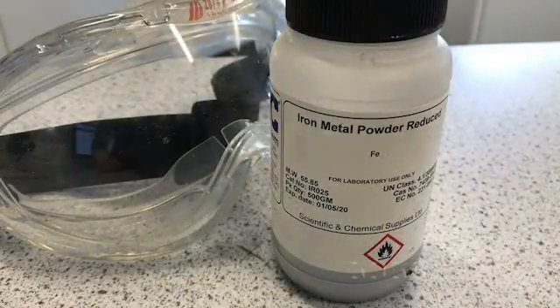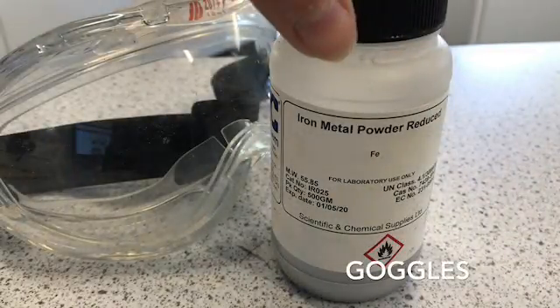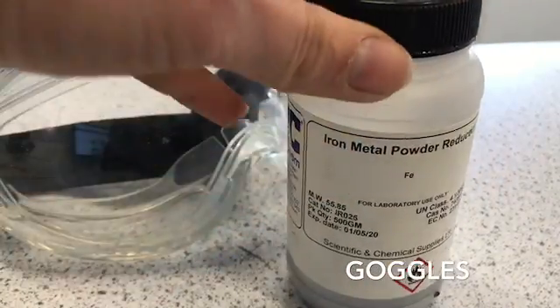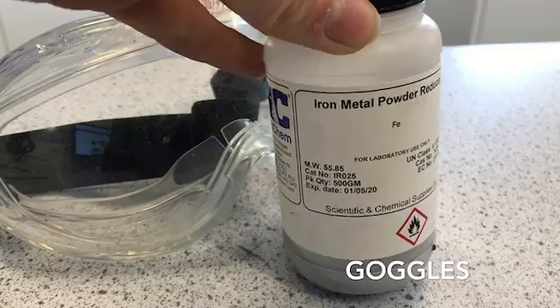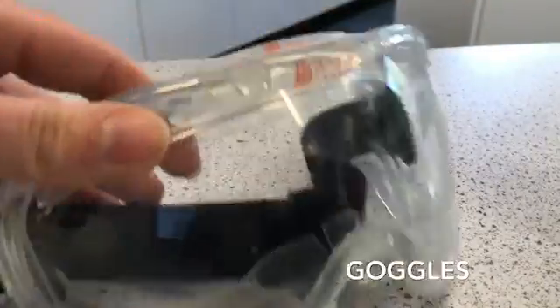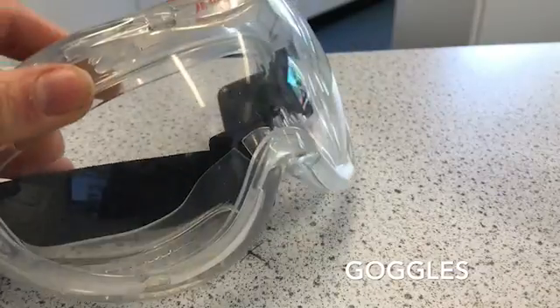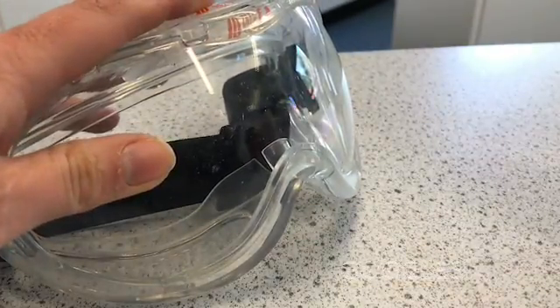Safety precautions for this experiment are that we need to make sure that the iron and sulphur powder have the lids on and are kept away from any open flames that we're using. We also need to make sure that we wear goggles as soon as we are using the Bunsen burners to protect our eyes.